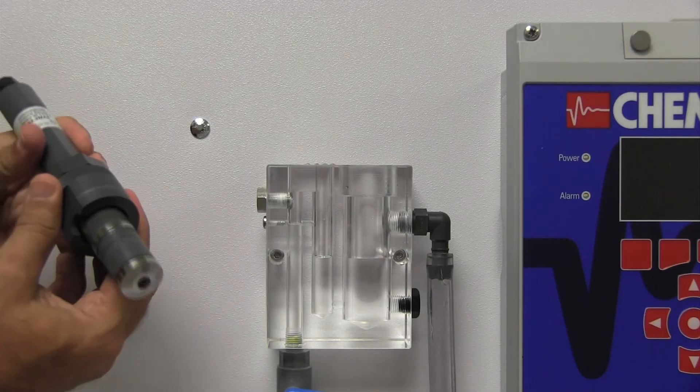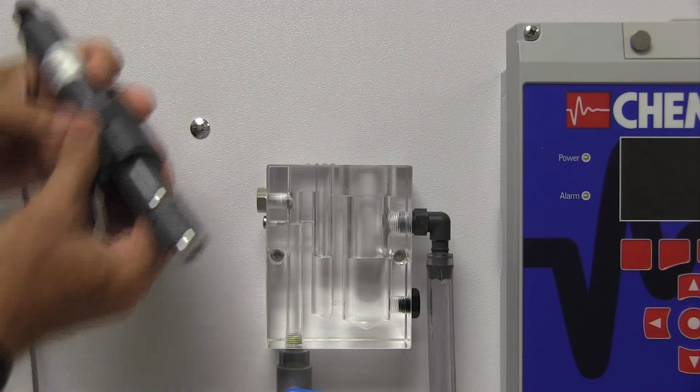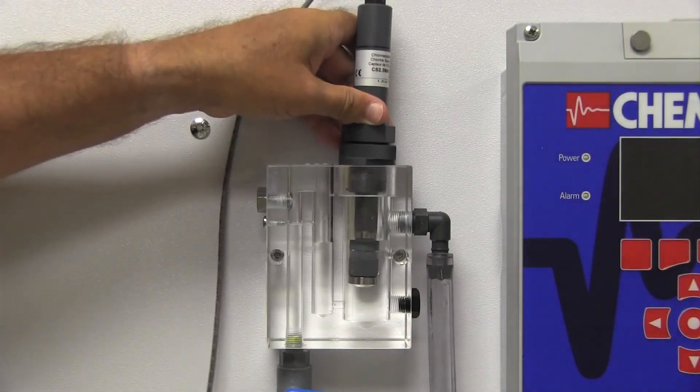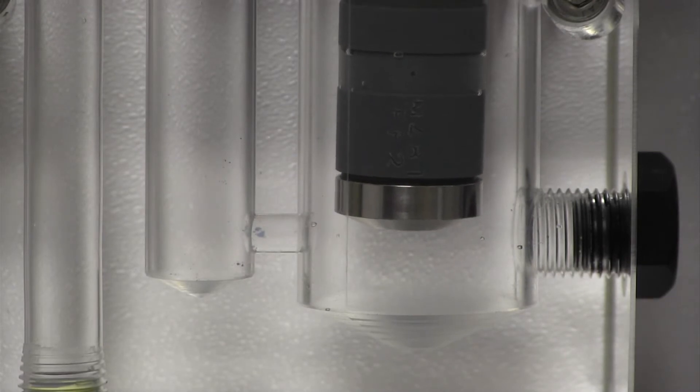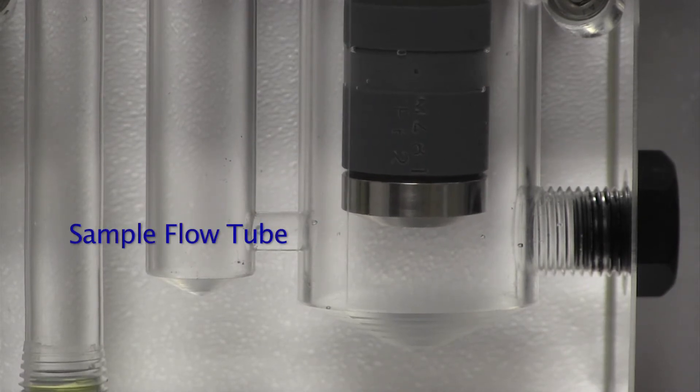When installing, slide the PVC fitting over the probe and then insert the probe into the flow cell. Adjust the PVC fitting so that the probe tip is positioned just above the horizontal sample flow tube near the bottom of the chamber.